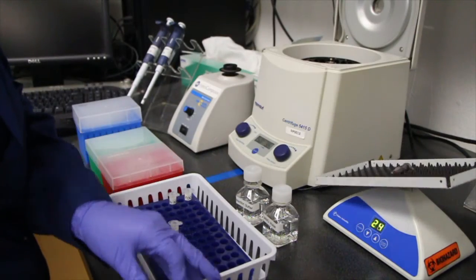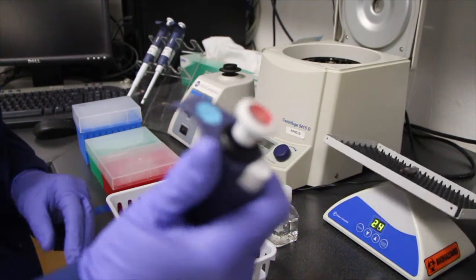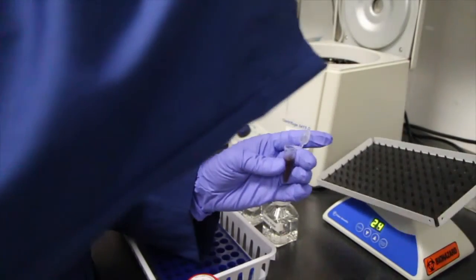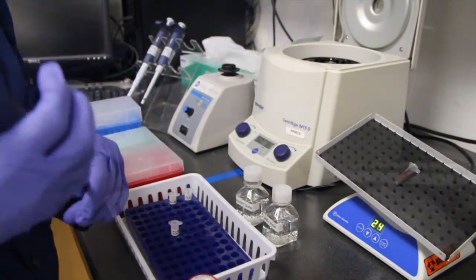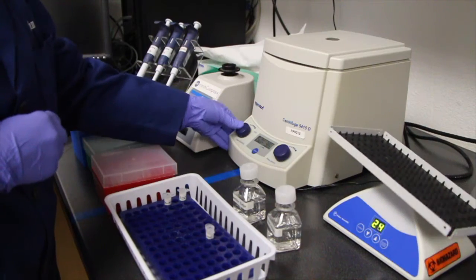After the antibody incubation is complete, quench any remaining active groups with an excess of primary amine. We use 10 microliters of hydroxylamine. Incubate for 10 minutes and repeat the centrifugation step to remove any excess hydroxylamine or antibody. You now have antibody conjugated to your gold nanoparticles.